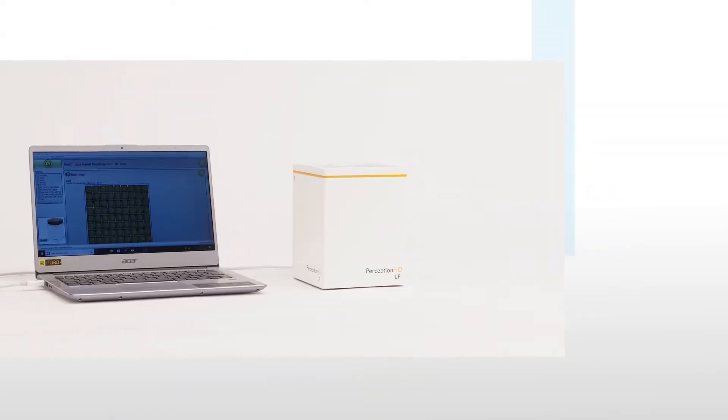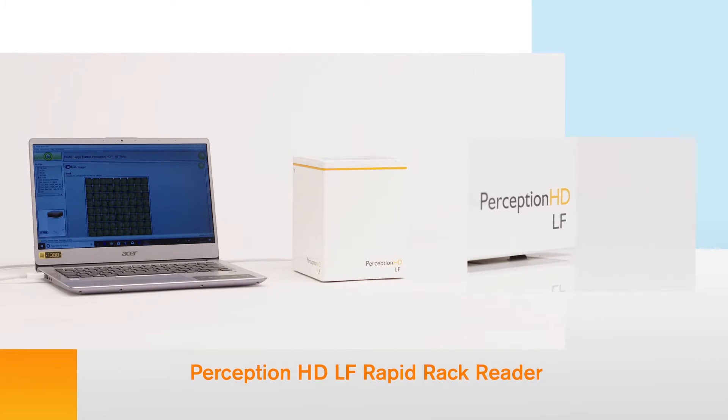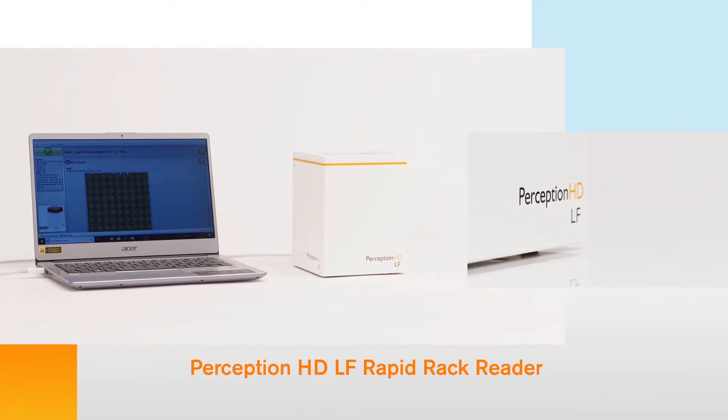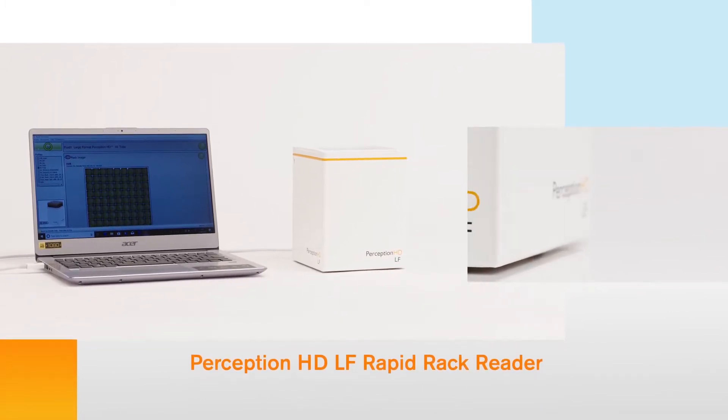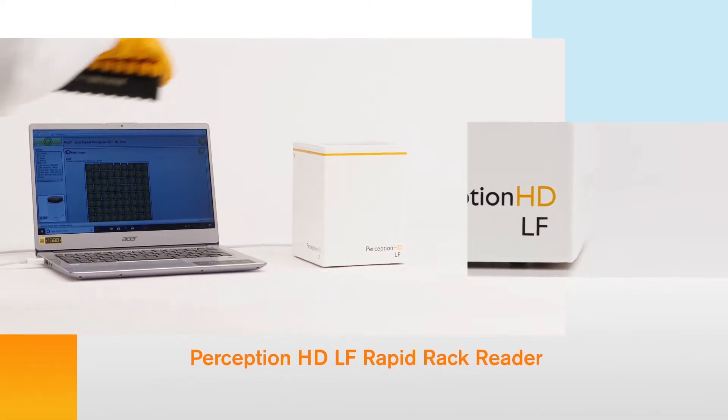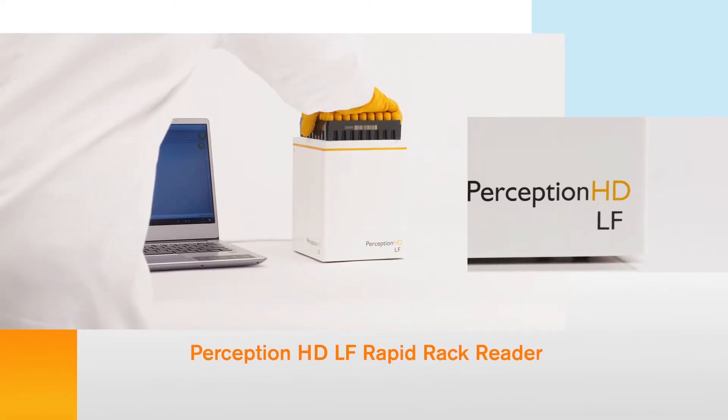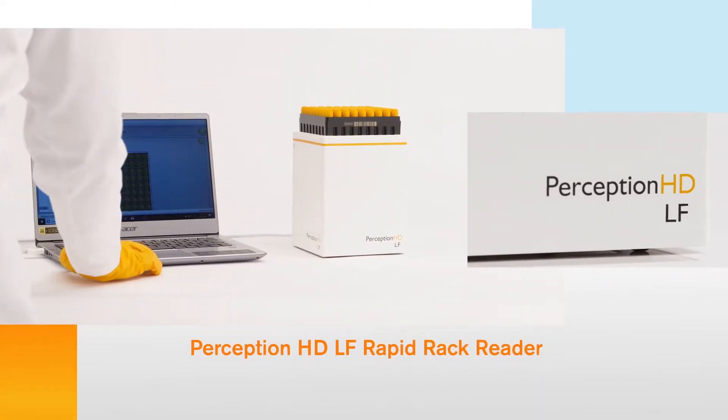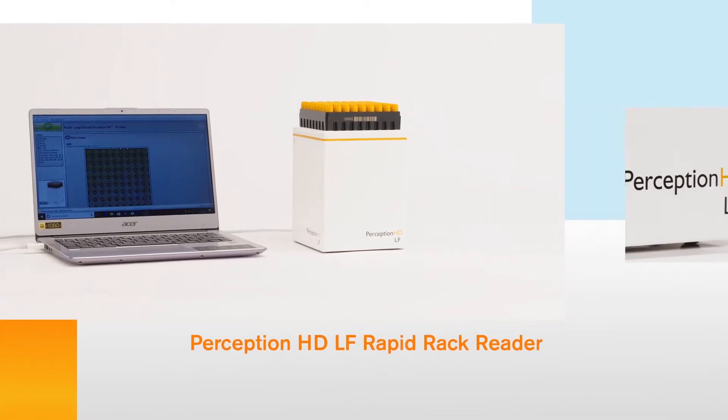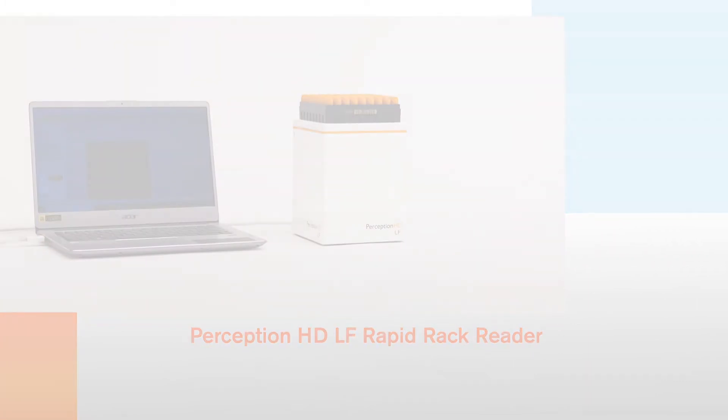In this video, we're taking a look at the Perception HDLF Rapid Rack Reader, which quickly identifies large and SBS format racked 2D-coded sample storage tubes in situ. The Perception HDLF Rapid Rack Reader is the result of nearly 20 years of industry-leading innovation.